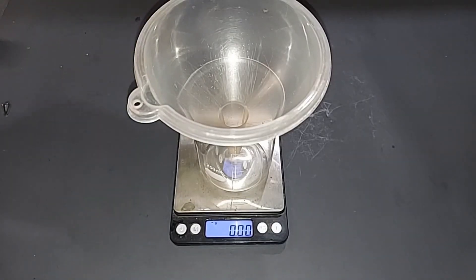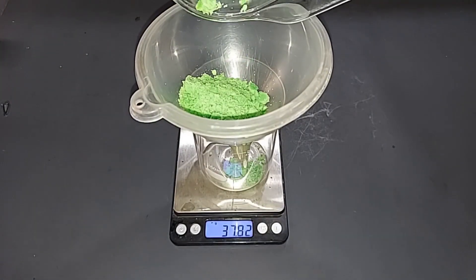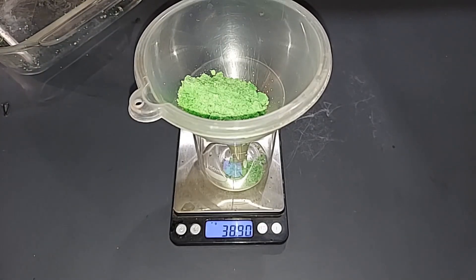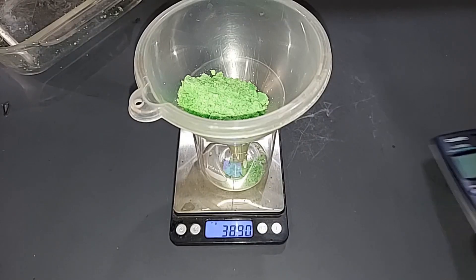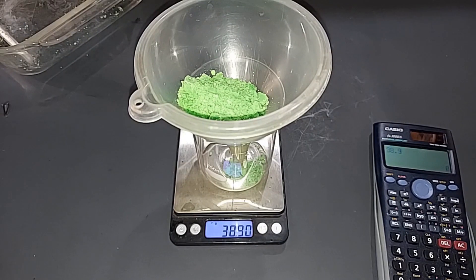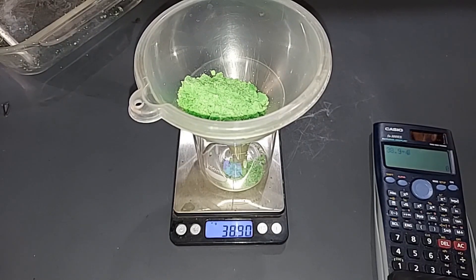Well, my goal or the yield should have been 40 grams theoretically, and we got 38.9. Let's do this really quick: 38.9 divided by 40 gives us a 97.25% yield.